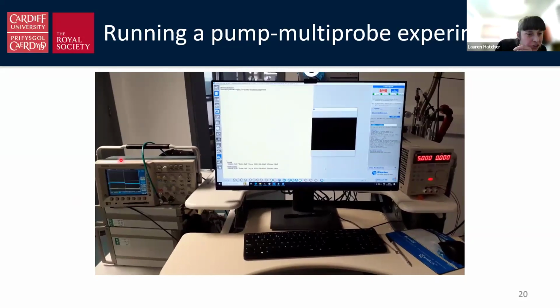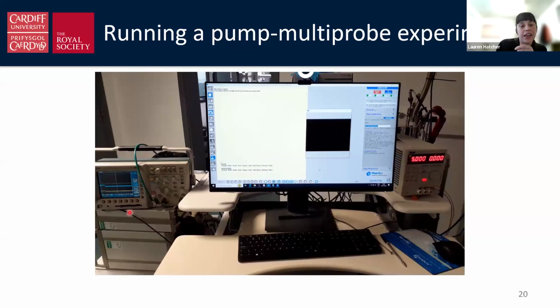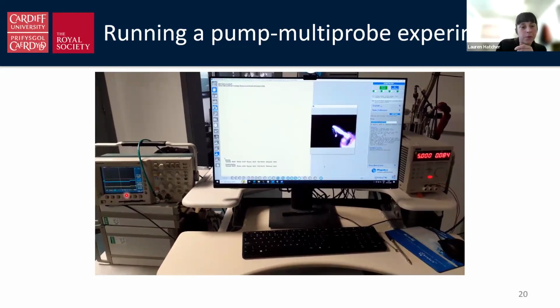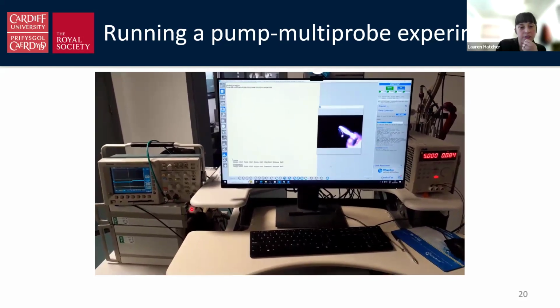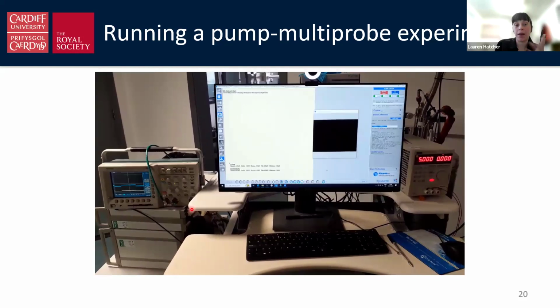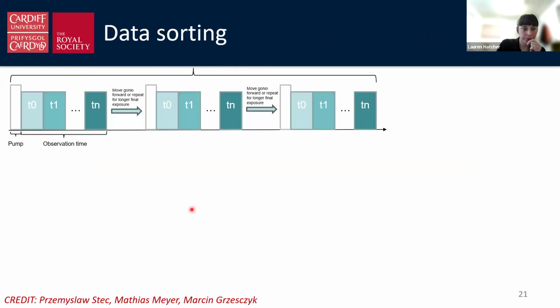Not very well tuned in, but the oscilloscope is marking up where we get the trigger signal and the LEDs on. So as this comes back on now, we get a bump on the oscilloscope, and this is doing 10 times pile up, and then we get a frame recorded within CrysAlisPro. So I'll show you how this works a bit more pictorially, and I really have to thank Prishamek for developing this for me, to make it understandable for everybody.